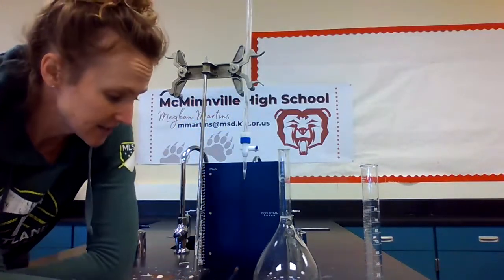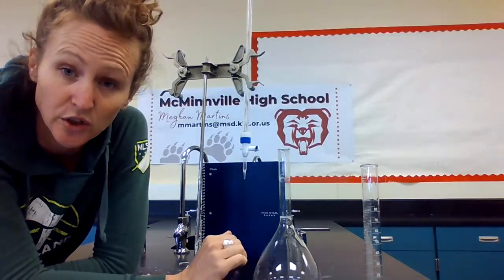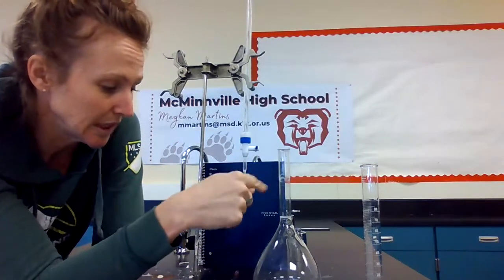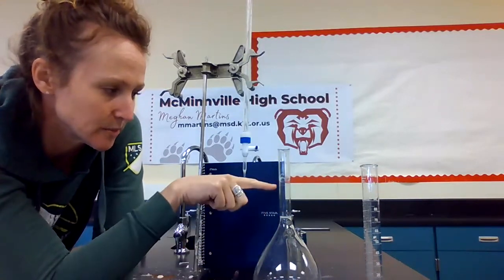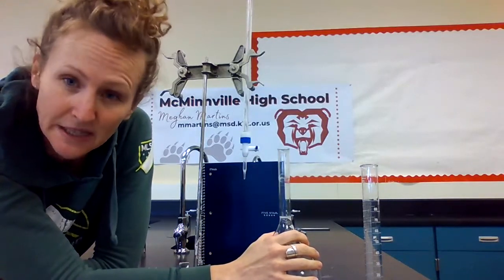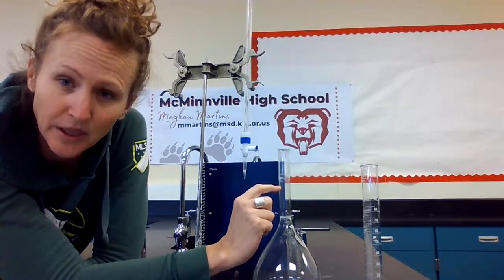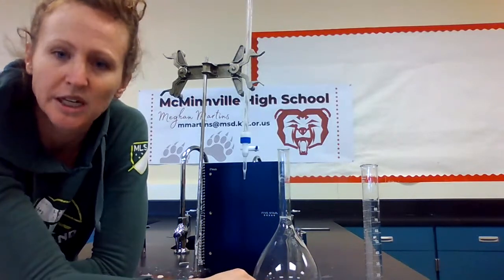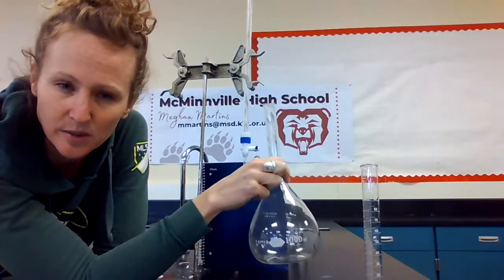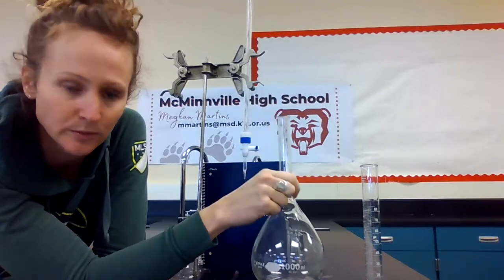Okay, and then the last thing we're already familiar with, this is a volumetric flask. It's used for diluting stuff because we can add in a stock amount or a sample or a solid, and then we can dilute up to a very specific mark. So volumetric flasks are really good at mixing stuff. Very precise measurement, but it only has one measurement because usually we're going to dilute to a very specific volume, and so we can choose a volumetric flask at that volume.